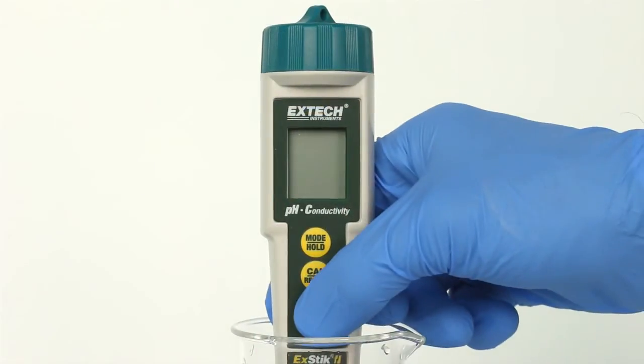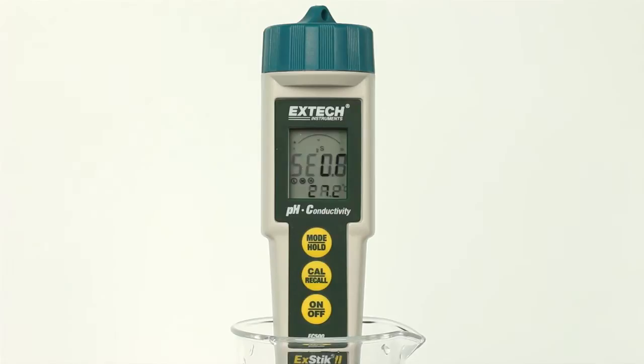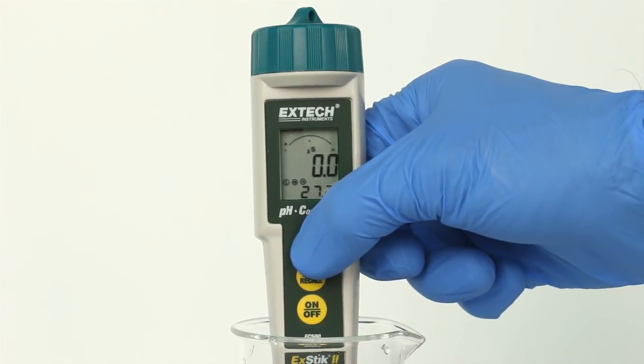Press the ON button to turn the meter on. Self-COW will appear in the display during the turn-on diagnostics. Press and hold the MODE/HOLD key to scroll to the desired measurement mode.